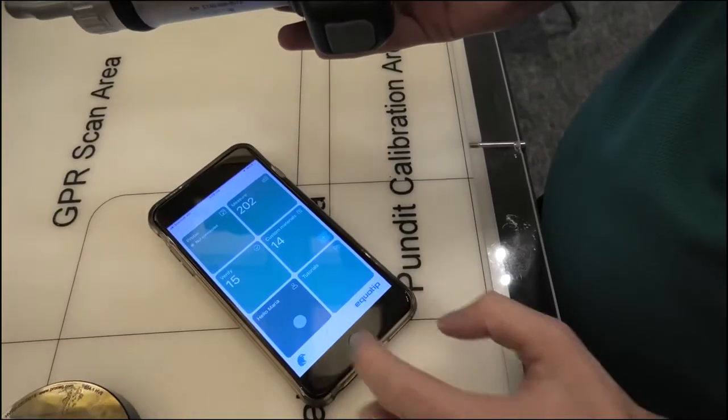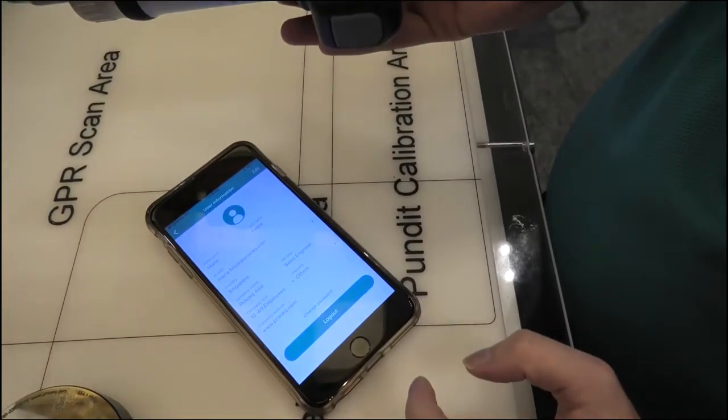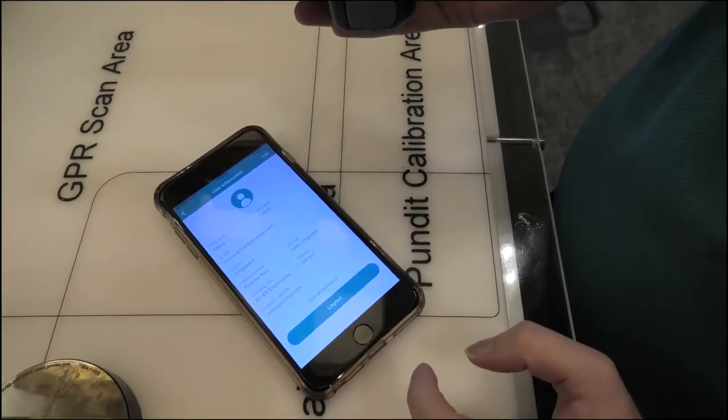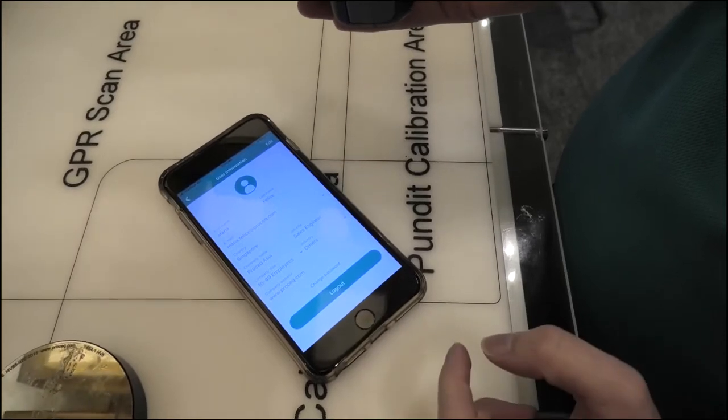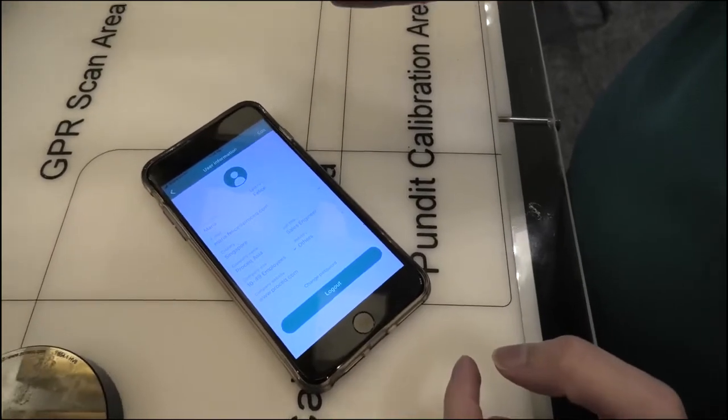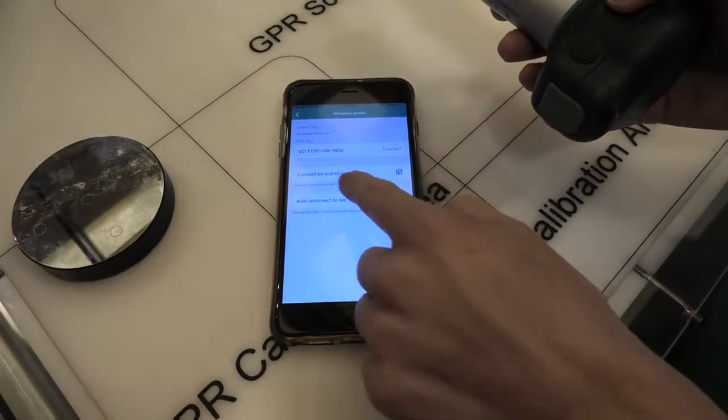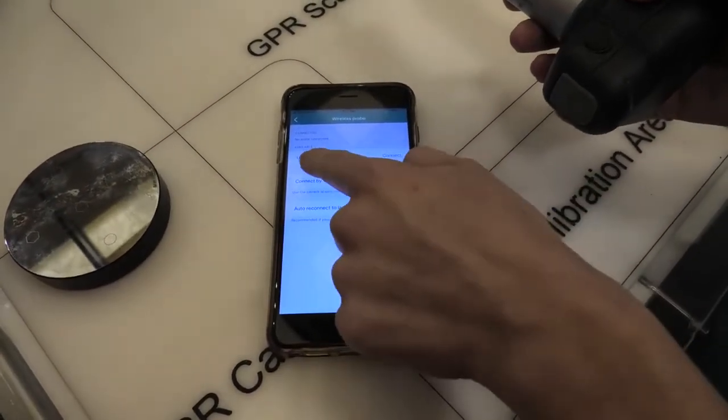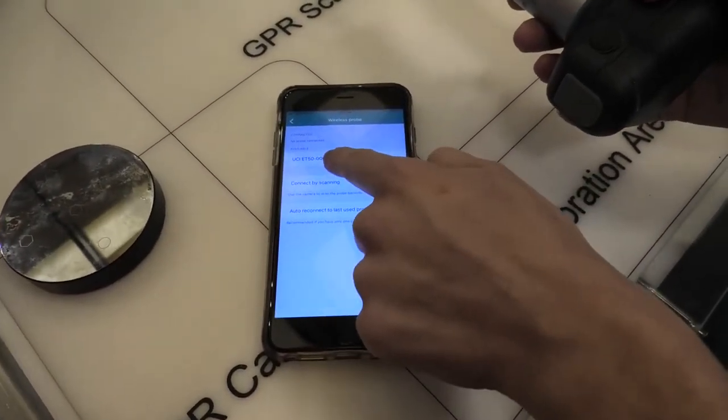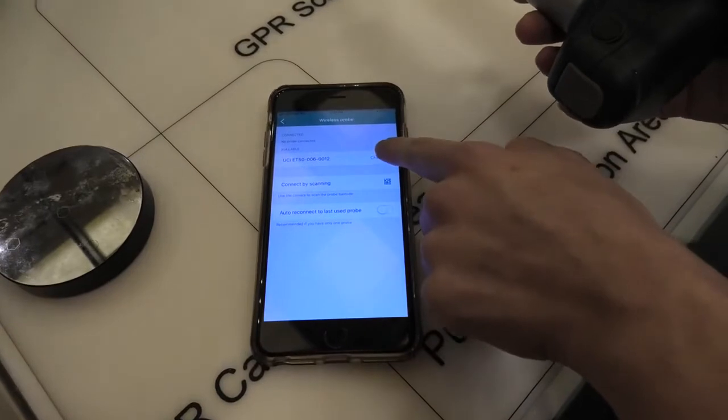So it's important that we are signed in to our account, and you can just set up an account if you don't already have one. Click here, and then we see our UCI probe listed here, and press connect.